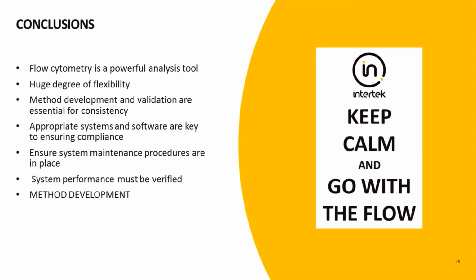And in case I haven't emphasized this point enough throughout my presentation, spending time on method development is crucial for any validated flow cytometry method. Establishing and locking down parameters can really reduce headaches during the method validation stage.